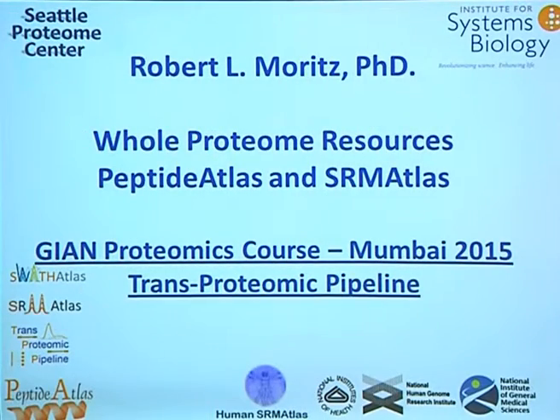So we take a lot of the information from all of the mass spectrometry runs that you've been learning how to process, and that data now gets curated and put into these online resources that we call the Atlas resource. And there's a number of different Atlas resources that make this up. So in this session, we're going to talk about both the PeptideAtlas and another component called the SRM-Atlas.